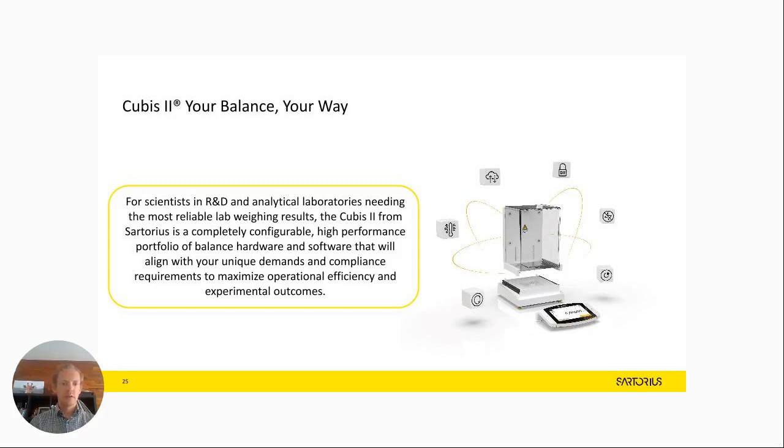Just from my experience, not everyone is yet required to work under 21 CFR Part 11. If you work in biopharma, it could definitely be that you are. If you work in an industrial environment, it can be that you are, but it can be as well that you aren't. Either way, I think it's always about being worried about my private data and what happens with it. And if it would be my professional data, I would at least think about it. I think that's why you're attending today, and maybe that helps you for any future decision related to your data handling.